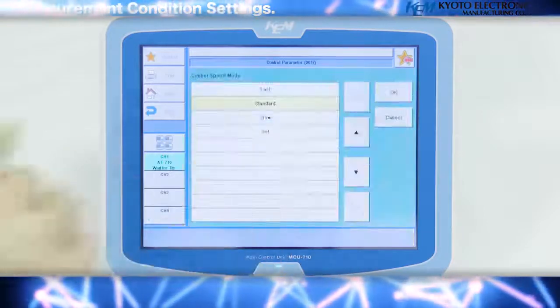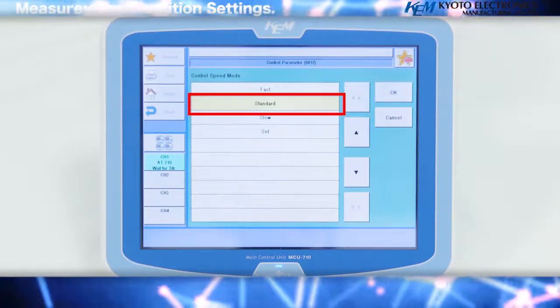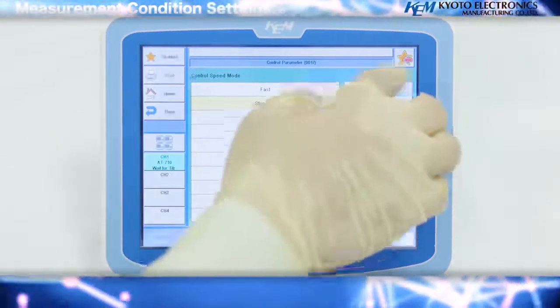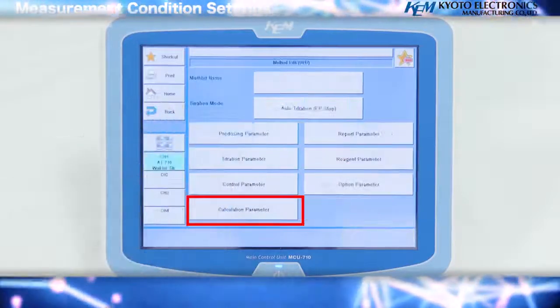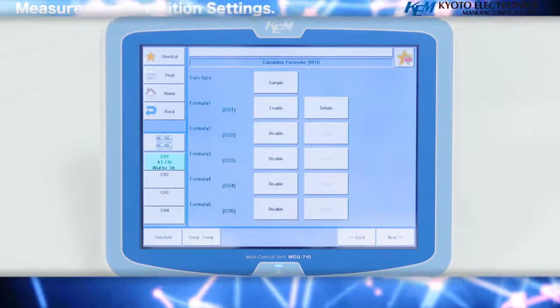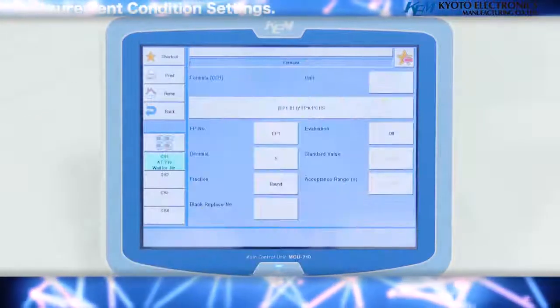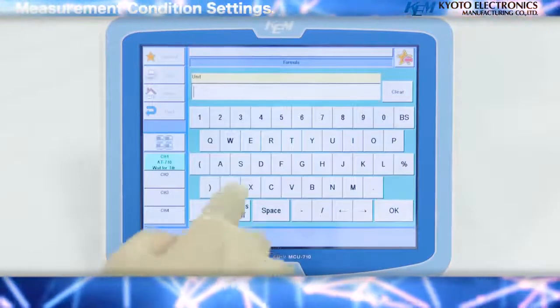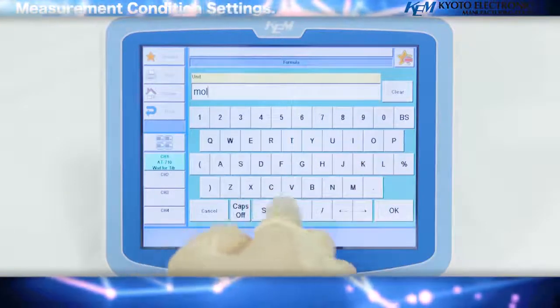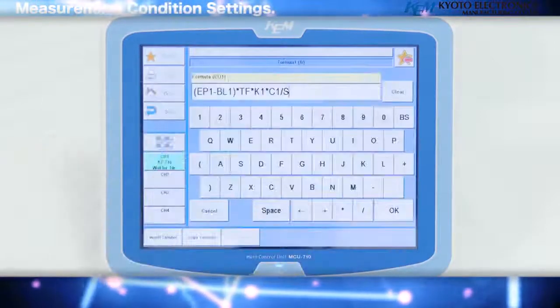Press the control speed mode key. This sets the titration speed. As this procedure will require normal titration speeds, select standard and press the OK key. Press the back key once, then the calculation parameter key. This time we will perform a titration using calculation formula 1. Confirm that it is valid and press the details key. Enter the units — for this case, select mole per liter and press the OK key. The unit of concentration is decided by the selection.